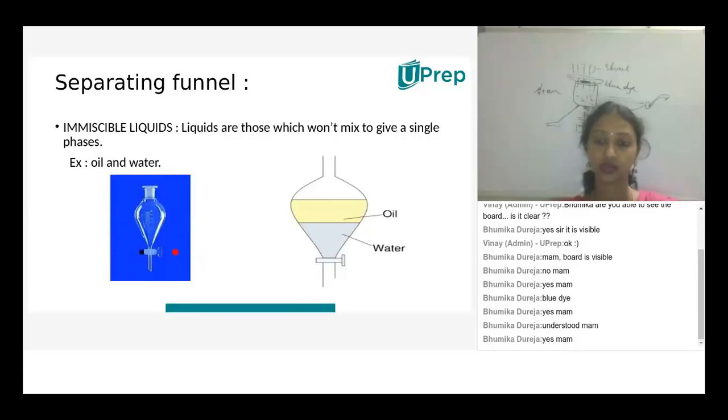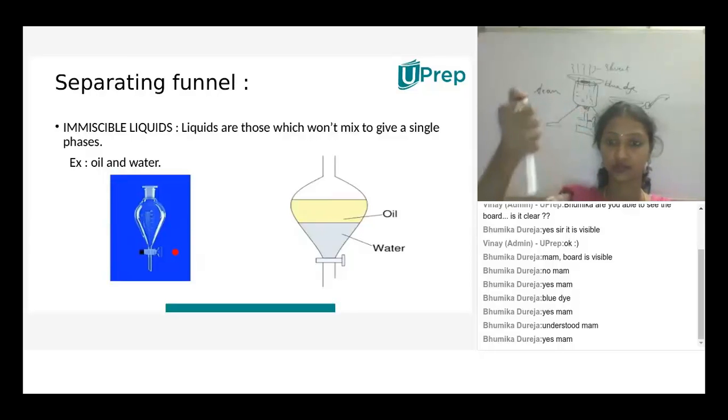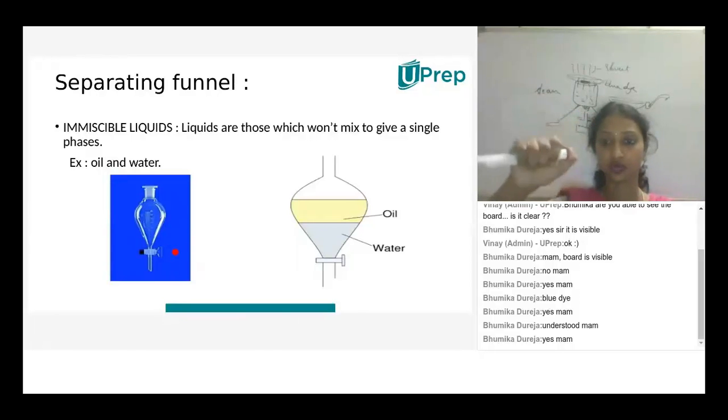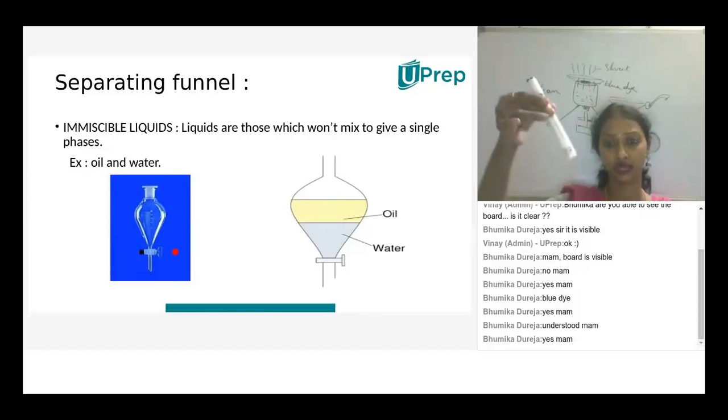We should know that. Test tubes also, we need to hold like this. We shouldn't hold the test tube like this or like this. This is wrong. How to hold the test tube, children? Like this. If we want to tilt it, we tilt like this. We can't do it like that because if it is acidic in nature, there is a chance of burning. And if any impurities are present on your hand, they may react with the solution. So how to hold the test tube? Like this.